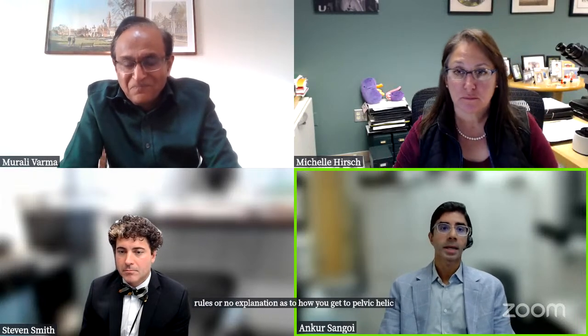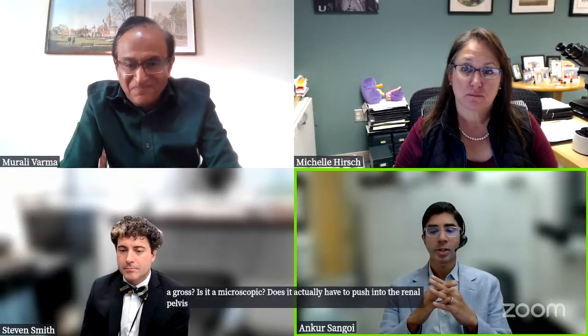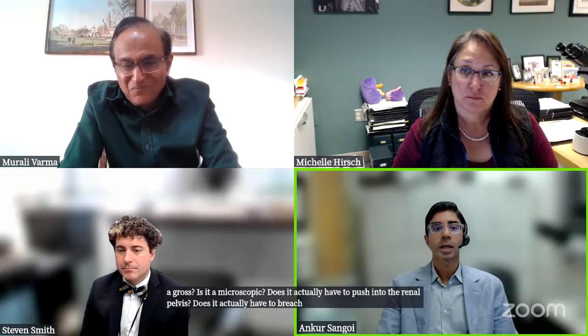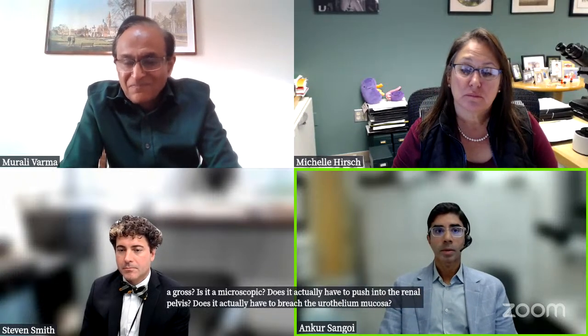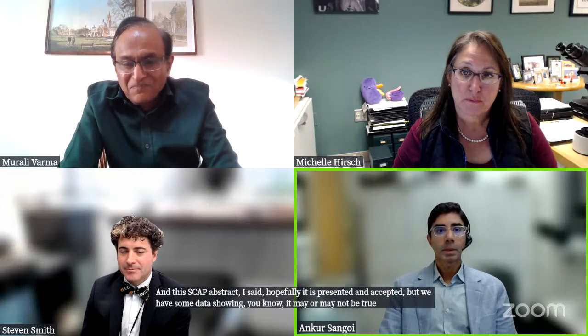Is it gross? Is it microscopic? Does it actually have to push into the renal pelvis? Does it actually have to breach the urothelial mucosa? In this USCAP abstract, I said hopefully it is presented and accepted. We have some data showing how people do it, which may or may not be true.